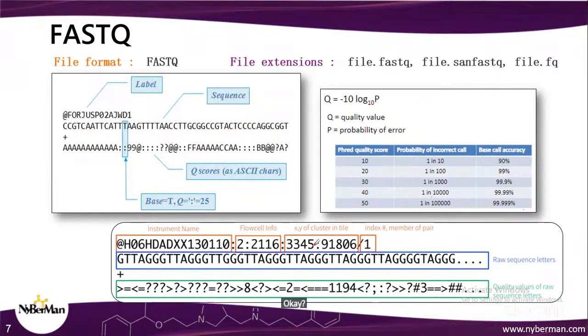Okay, so the other pieces of information are also related to the instrument that we are using and what setup we have used there, based on the clusters, like the number of nucleotide sequences. For example, if we fix it to take a cluster of 15 nucleotides at once and then assign the quality score, so that if the quality scores are assigned in small chunks, maybe that will be captured more appropriately.